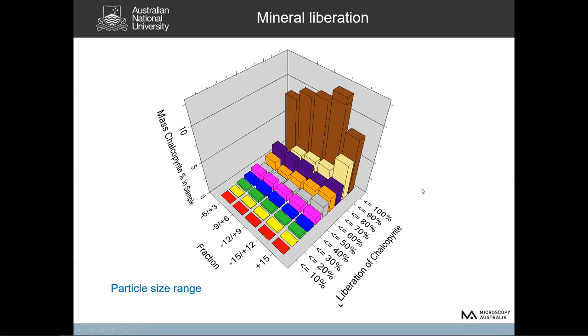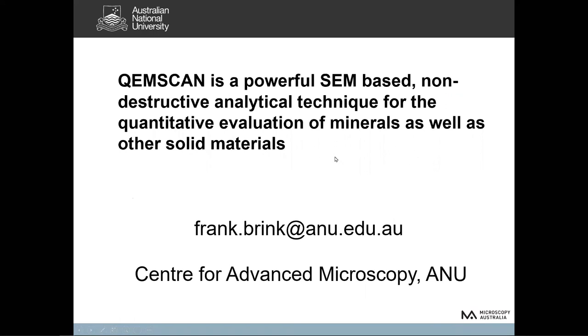So hopefully I've been able to give you a better idea of what QEMSCAN is, how it works, and what it can do, and certainly that it's a powerful SEM-based technique for evaluation of minerals as well as other solid materials.